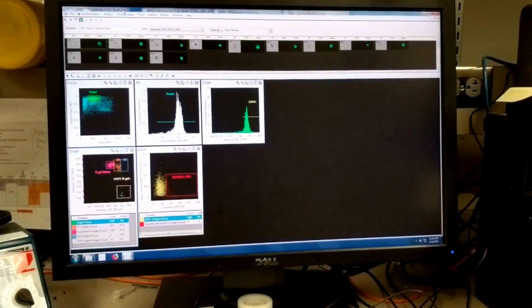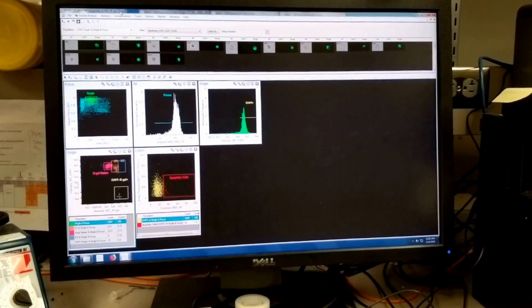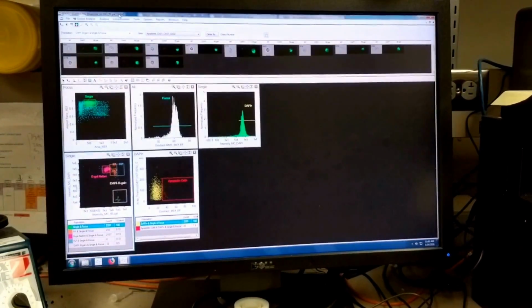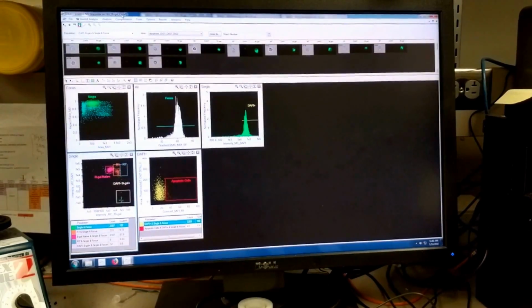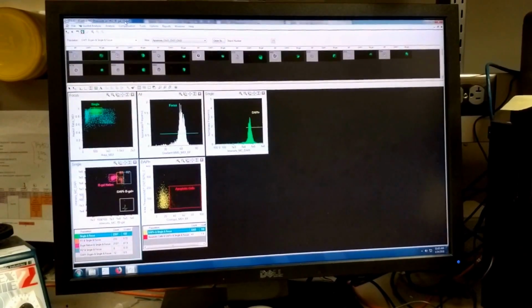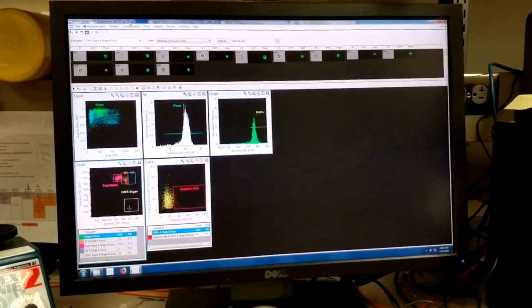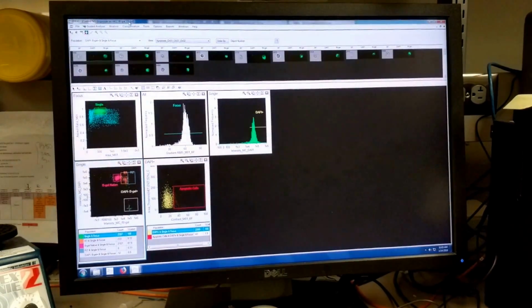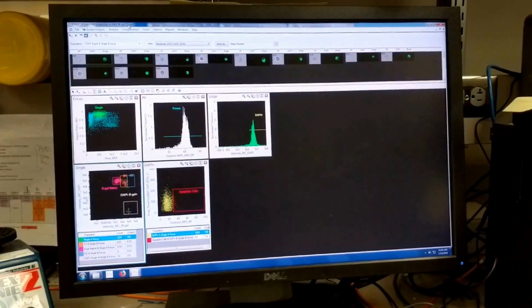So the experiment is pretty simple. Jun took HK2 cells, and she plated them and then induced etoposide, and 48 hours later we look at if the beta gal increased. So last time we took the conventional beta gal and we found that HK2 cells express beta gal, so the conventional beta gal won't work.